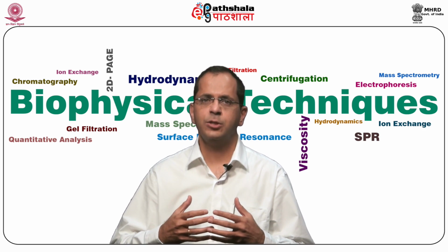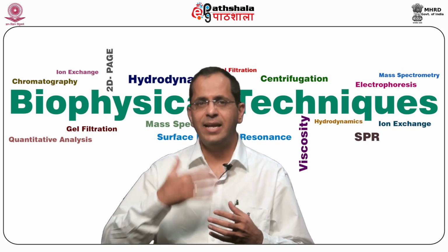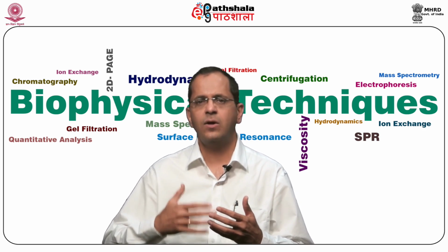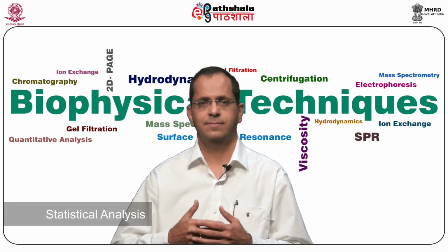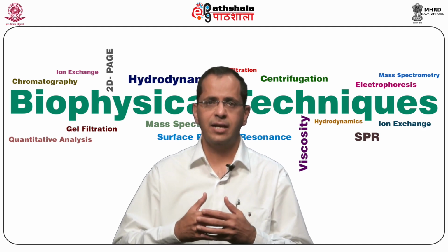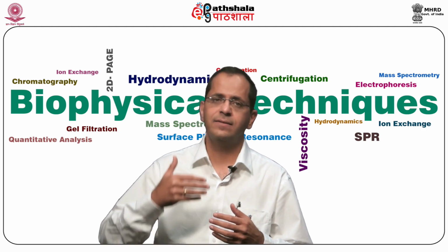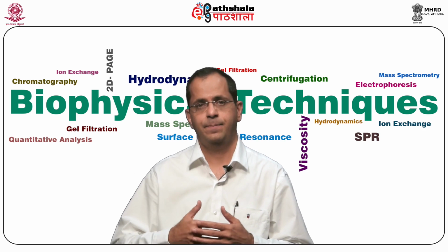Discovery is done using a small set of samples, but the validation has to be done using antibody-based assays on a large cohort that helps in statistical analysis. Of course, there are certain limitations of gel-based proteomics, and those have to be borne in mind either while doing the experiment or at the time of interpretation of data.